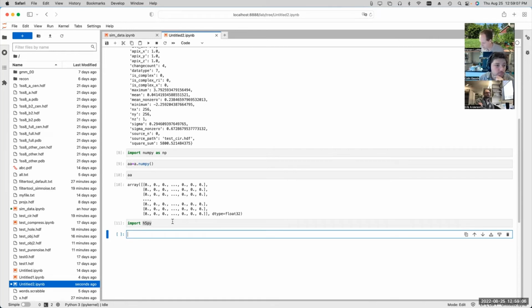That HDF5 file, like EMAN, will pretty much only be readable again by TensorFlow or by a generic package, which you can sort of tell to read any part of the structure. So you could write that whole TensorFlow object to a single HDF5 file, and you can read it back again. And EMAN does this. So in cases where we do neural network training, we will actually store those objects as HDF5 files with a .h5 extension instead of an HDF extension.